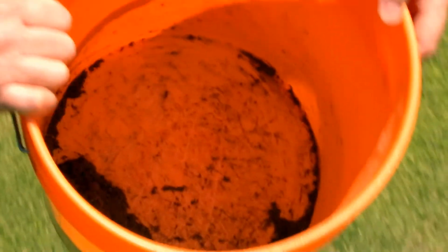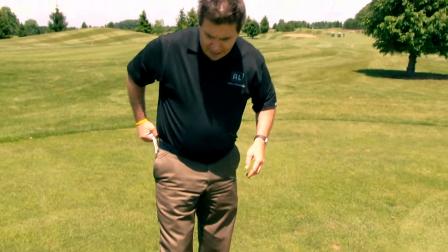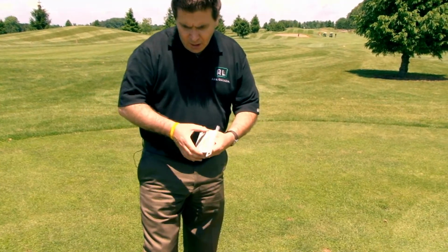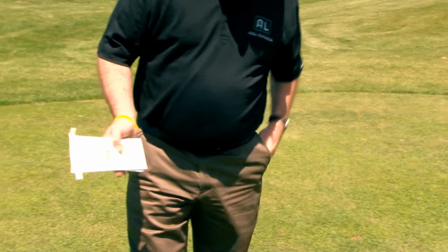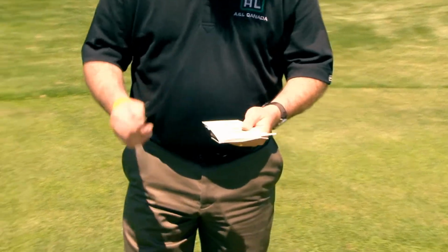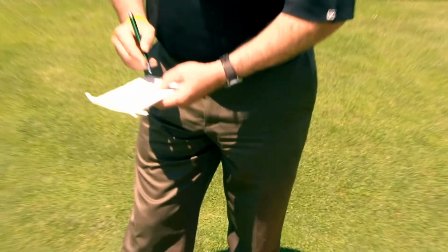Once you've got that nice sample, we're going to put it into our bag that we're going to send to the laboratory. On the bag, we just want to make sure that we indicate the information that we want when we get the report back, so make sure you clearly put the sample number and your name and address on it.